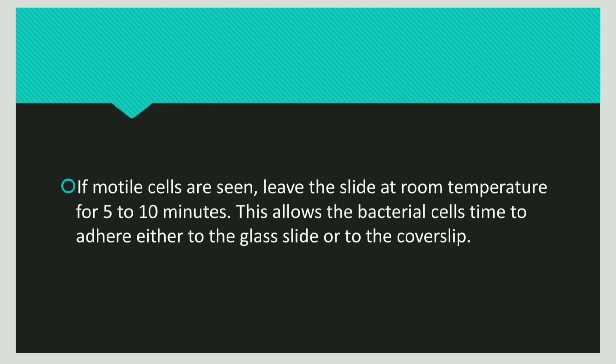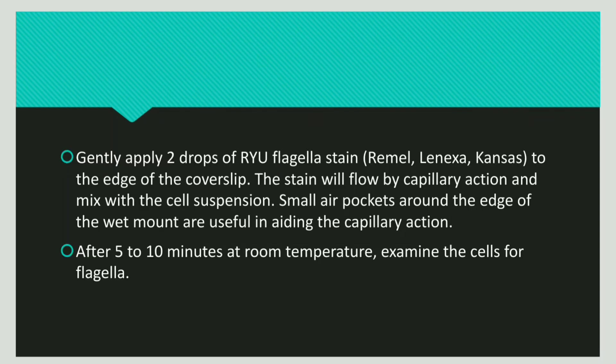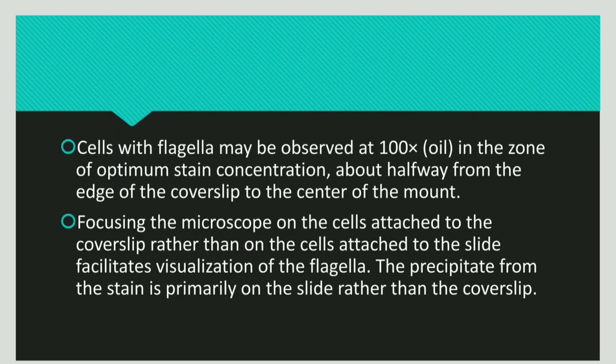If you observe motile cells, leave the slide at room temperature for 5 to 10 minutes. This allows the bacterial cells to adhere to the cover slip or the glass slide. Then apply the Ryu flagellar staining solution to the edge of the cover slip. This helps the stain to move by capillary action and mix with the suspension. After 5 to 10 minutes, examine the cells under a microscope. The cells with flagella are observed under 100x oil immersion.